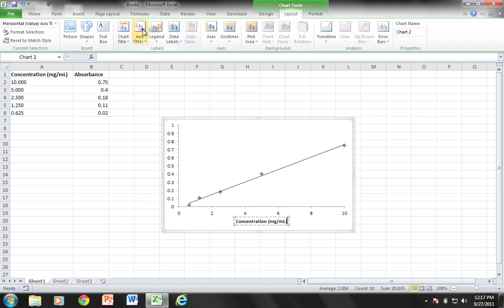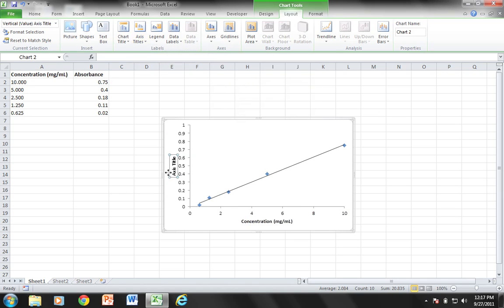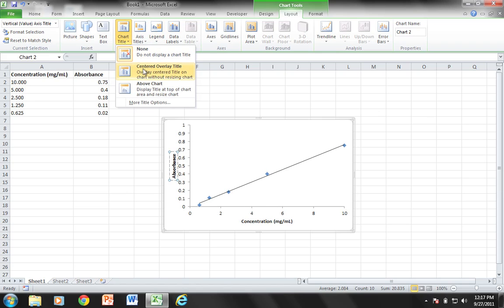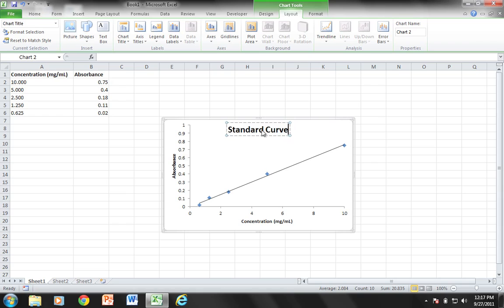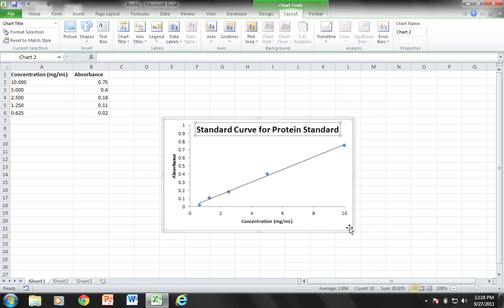I'm also going to add an axis title for the vertical rotated title, and this is going to be absorbance. And then of course a chart title, centered overlay title. I'm going to say standard curve for protein standard. I'll move it over here just a little bit and I can enlarge my graph if I need to.